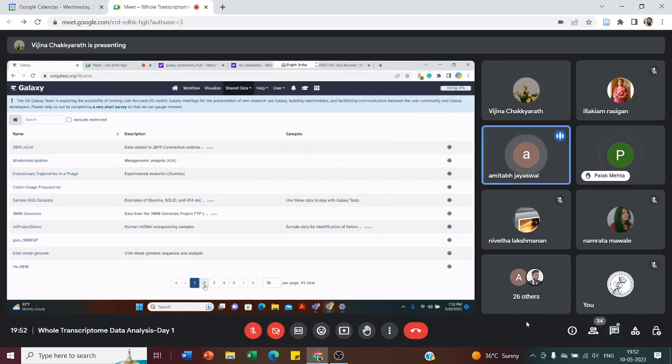Ma'am, if there is any tutorial which you have yourself used and tested, please guide us. For that, I'm telling you to just download that particular data, because I already did some analysis. Still, I'll show you.